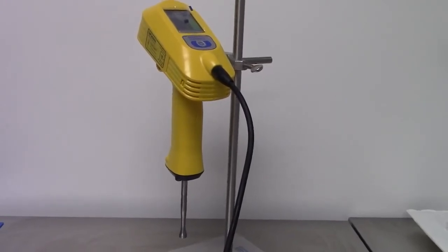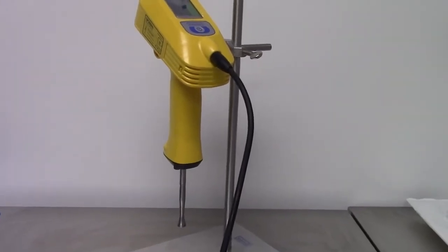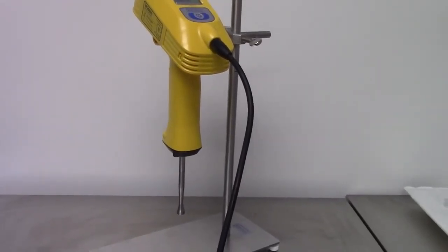In today's video, we're going to calibrate the unit. The unit should be powered on, and the sonotrode should be completely dry.